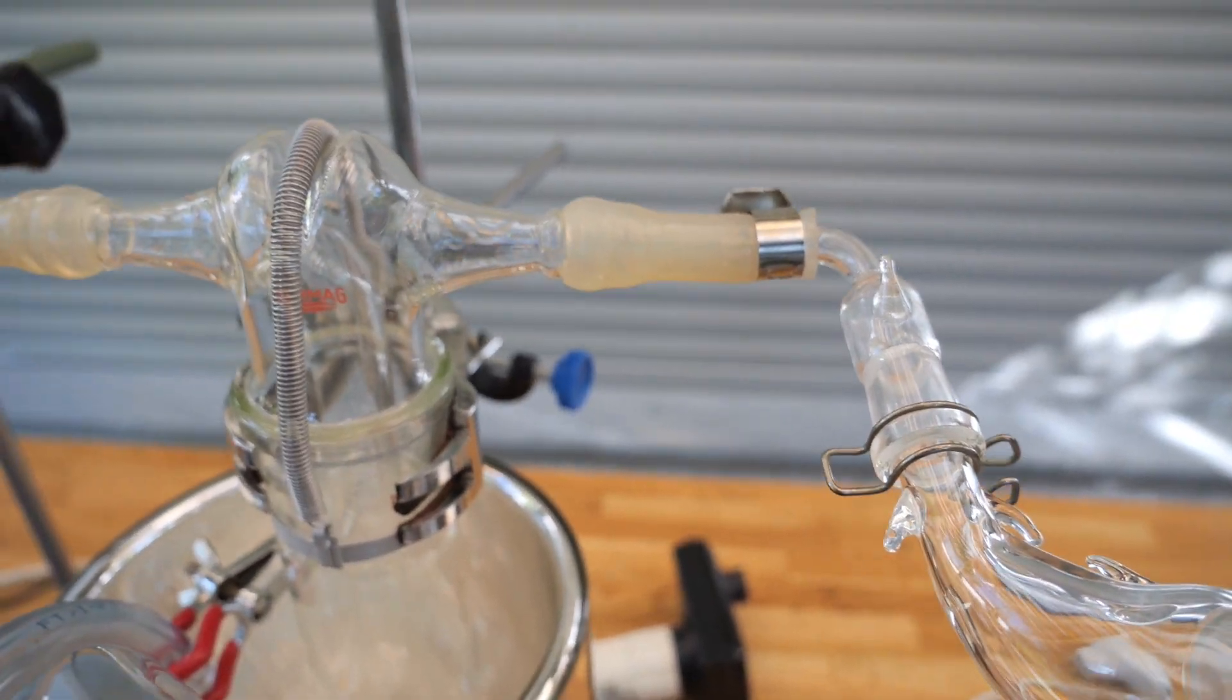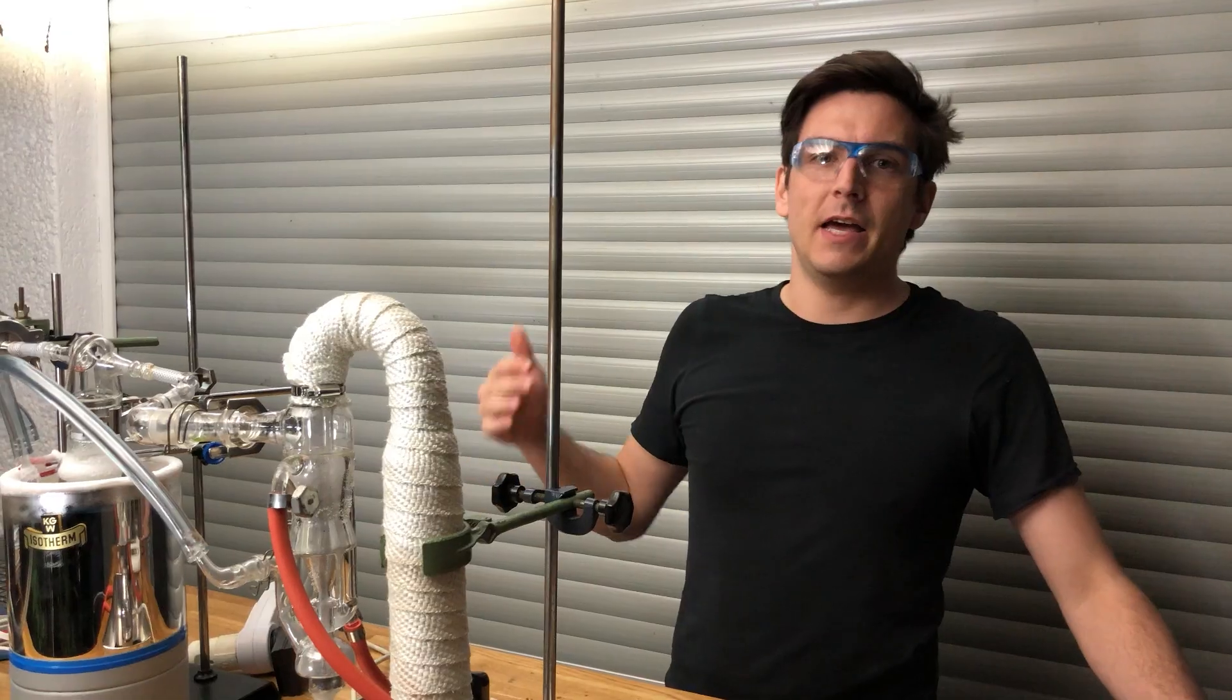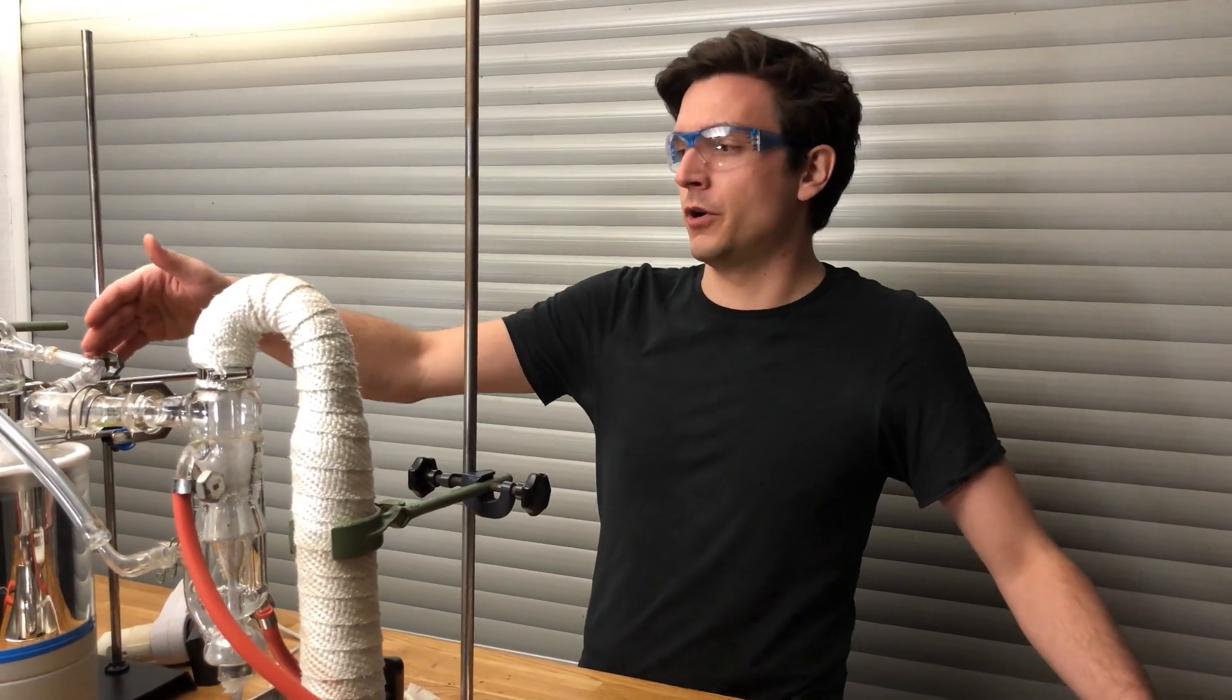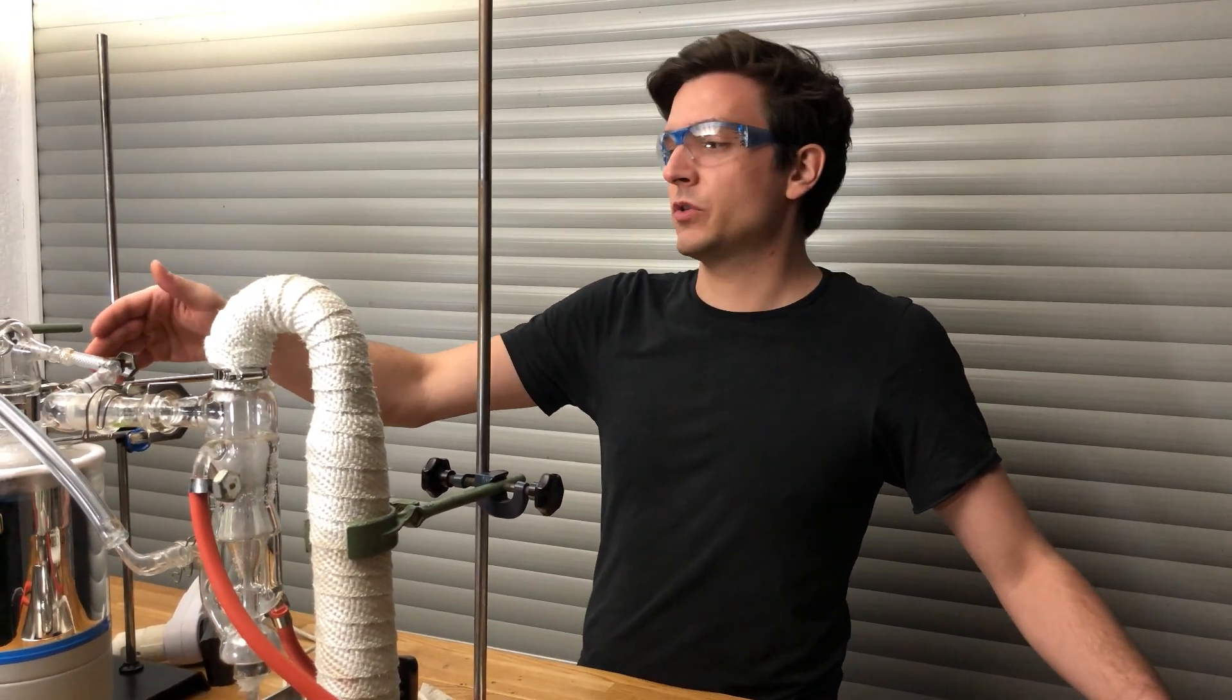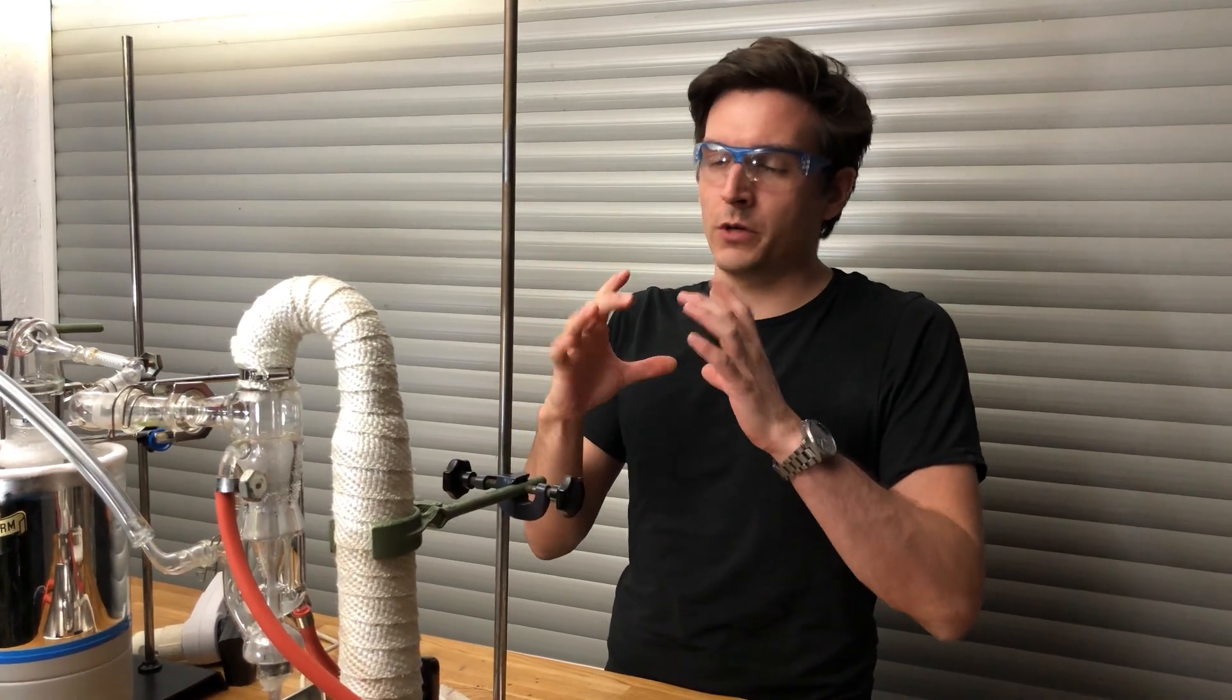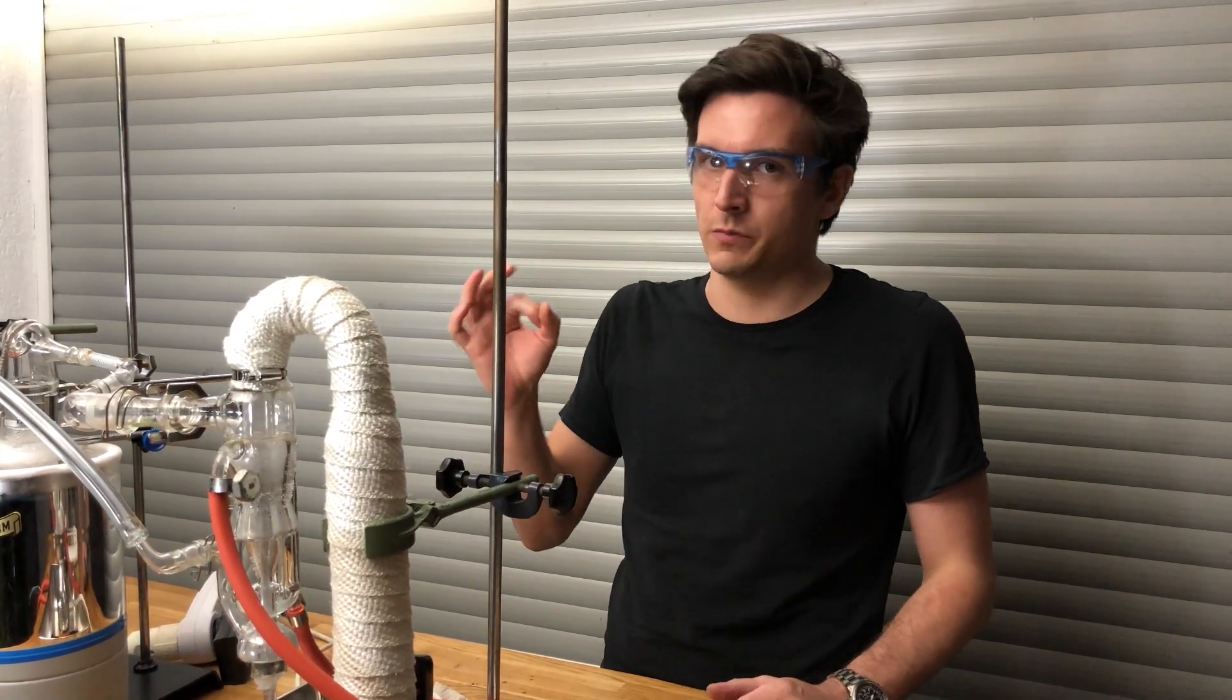I think the main culprit are those hoses and the small diameter tubing at the high vacuum site. As I've explained before, that's not a good practice on a high vacuum system because on one hand the polymer is permeable for different gases and also outgasses itself, and the small diameter slows down the molecular flow. The molecular flow through a large opening of course is much faster than through a small one.